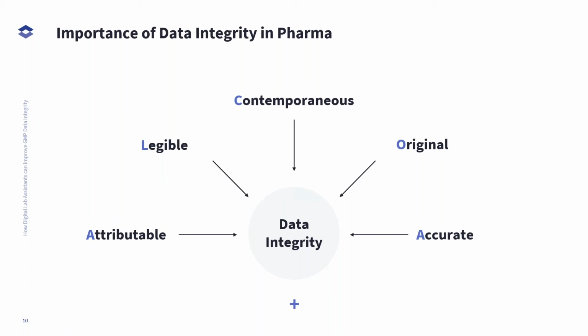We want to make sure that all the data is recorded at the time it's generated. So when we're setting up these quality systems around the test methods that will eventually go to a QC lab, we've built these things in from the beginning. Again, to Stefan's point, data integrity is a huge focus right now for inspectors worldwide, and this is the first place they go.